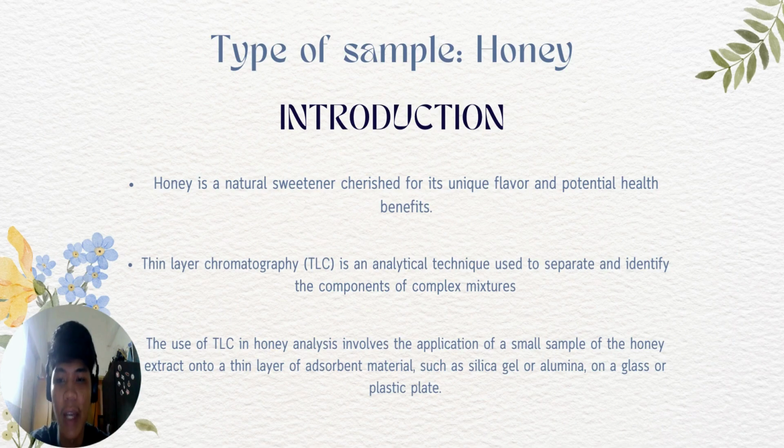We chose honey as the type of sample for this research. Honey has a natural sweetness, a unique flavor, and also potential health benefits. To gain the potential health benefits, we must extract the honey by using the thin layer chromatography method, which is an analytical technique used to separate and identify the components of complex mixtures.